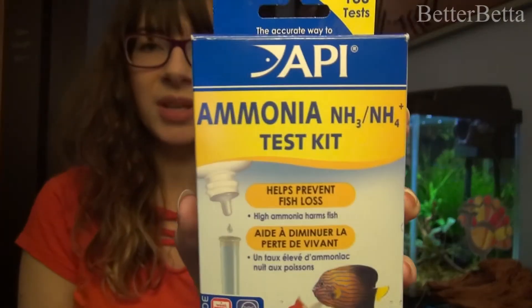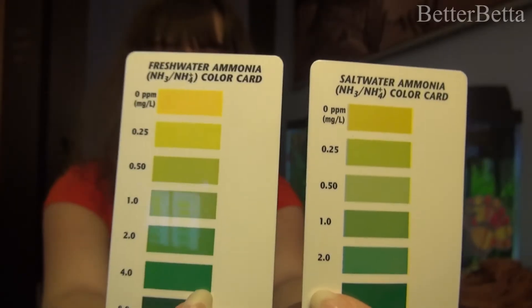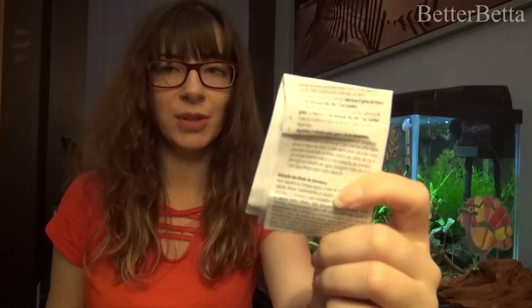The most common ammonia test kit that you're going to find is going to be from API, and it is just going to be the ammonia test kit in this box. You are going to find two color charts for you to compare your ammonia to — one is going to be for saltwater and one will be for freshwater. You will find two liquid test solution bottles and you will also find a test tube. There will also be a warning sheet and instruction manual in here as well — it is important to read those through.